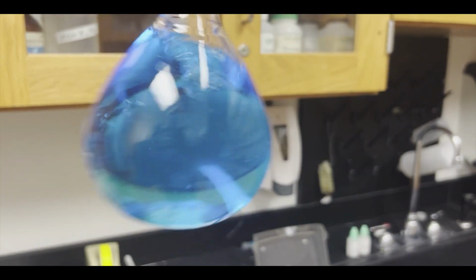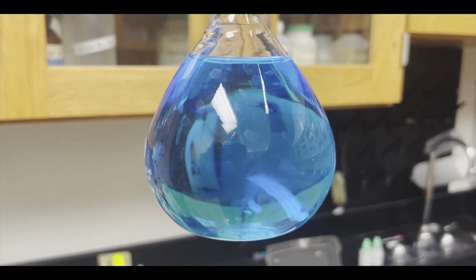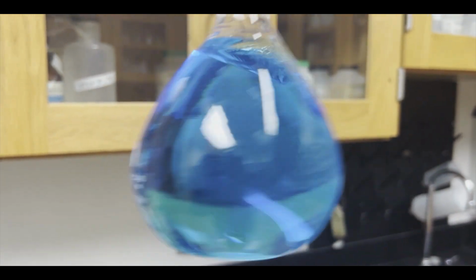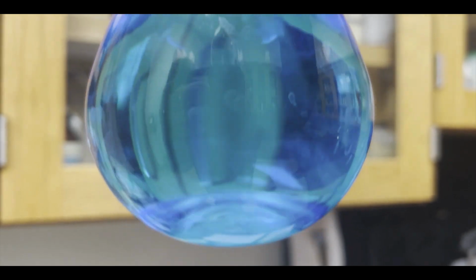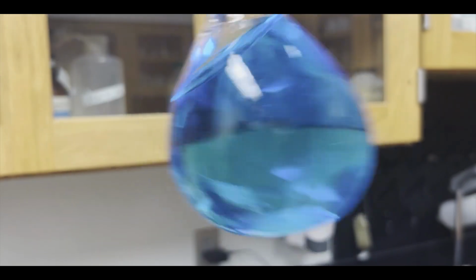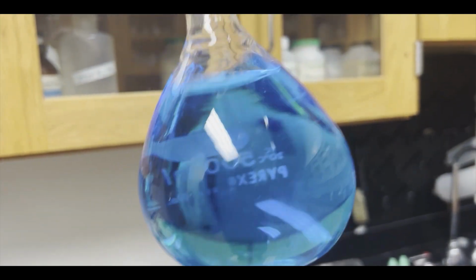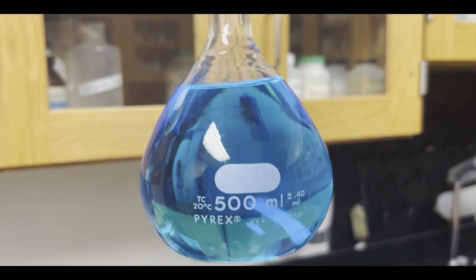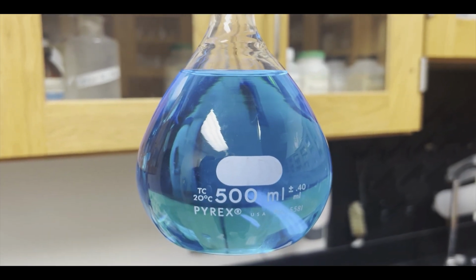Okay, so now if we take a look, I obviously stopped the film and started another segment here. The solution is much darker. And if we look, we can't see any crystals on the bottom of the flask anymore. Even as I swirl it, I can't see any of the solid. So that's how you know you've dissolved it all, because all the solid particles are gone. And obviously your solution will get darker and darker as that happens, all right?